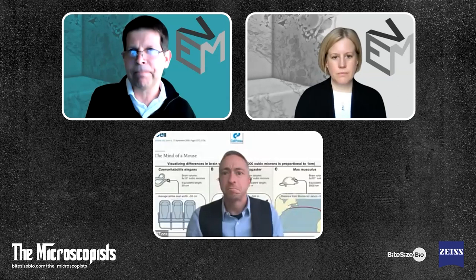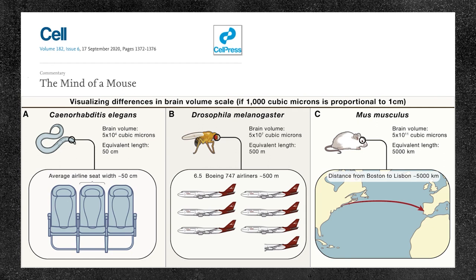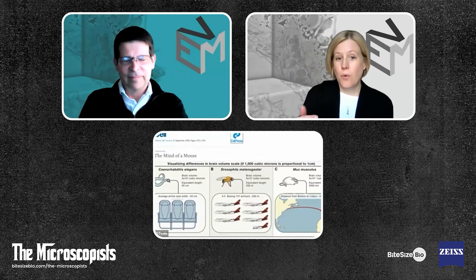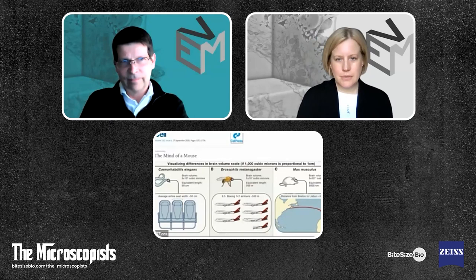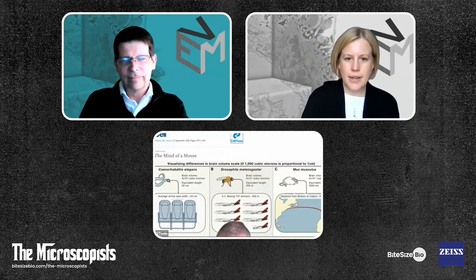Yeah, I agree. The data side has to change. Your background now is showing a figure from a paper called The Mind of a Mouse, and I love this figure because it makes it so easy to communicate the next steps in volume electron microscopy, or something else, but we assume at the moment it'll be volume EM. I said earlier that the mind of the worm has been mapped, at least from some worms, and now the connectomics community, which focuses on generating these maps of the connections of neurons, is working on the fly brain and has started delivering fly brains. But the next challenge is going to be the mind of the mouse.